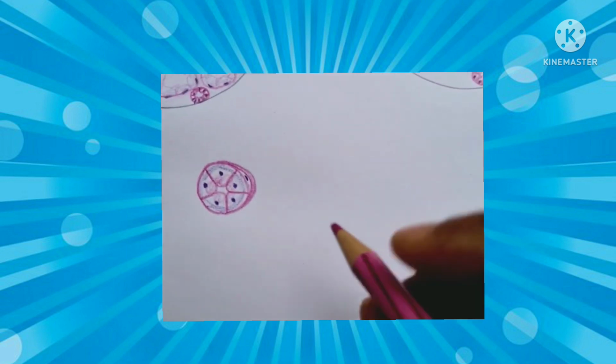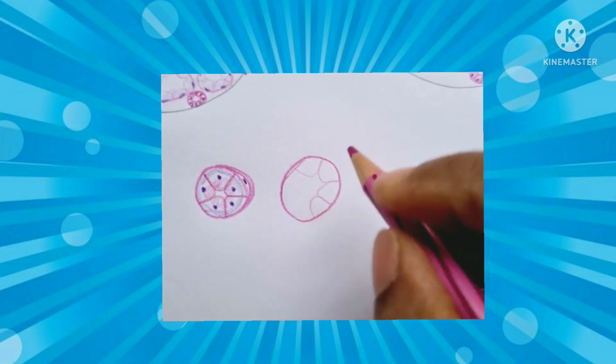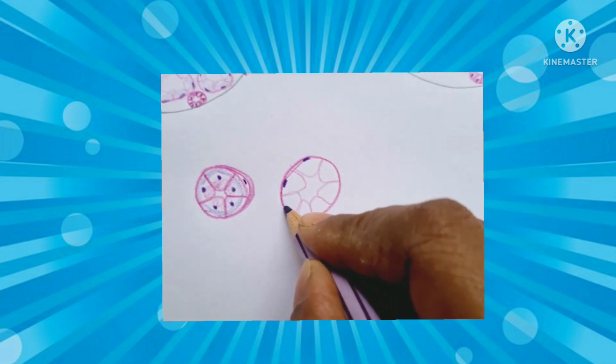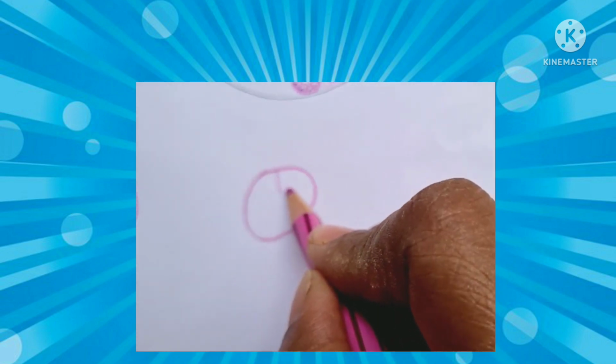Usually it will be surrounded by myoepithelial cells. These are cells which have a contractile property and help in squeezing the secretion into the ducts. They will be present between the basement membrane and the basal part of the cell membrane of these acinar cells. They will be present in all acini: mucous, serous, demilunes, everywhere.